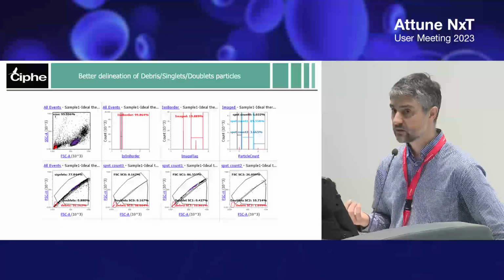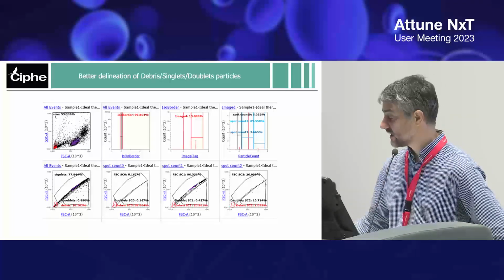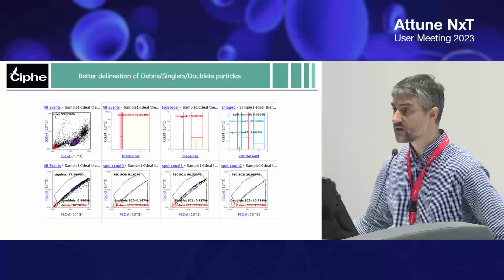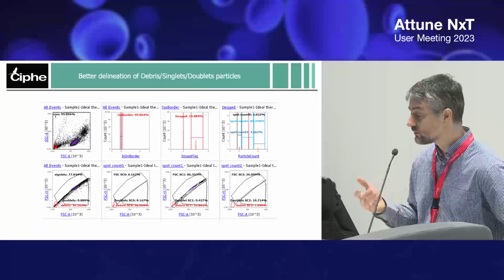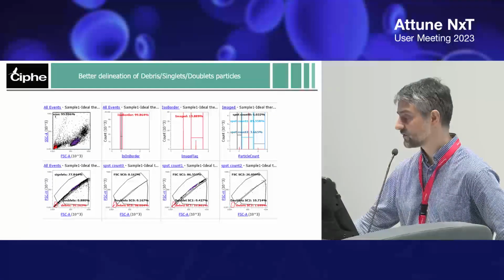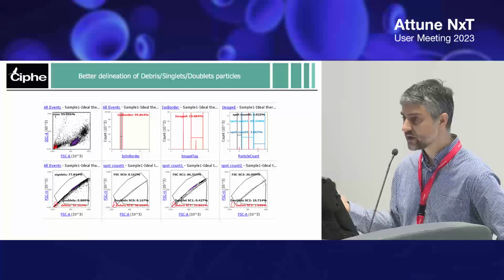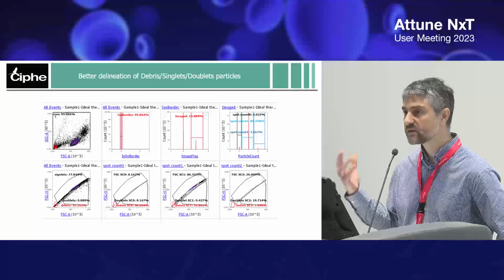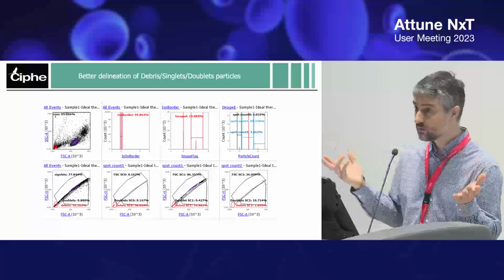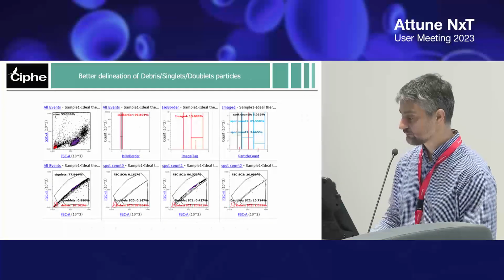I would keep these in my gate originally, because some of them are falling into my singlet gating. So it tells you that already, the way we do stuff sometimes is not completely appropriate. Obviously here it's not so much a big deal because we did a good job in sample prep, so we have single cells. But when you come to complex tissues, tumors and so on, and you need to remove doublets and you don't really know how to do it, then it's a different situation.